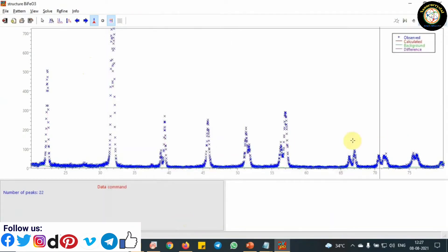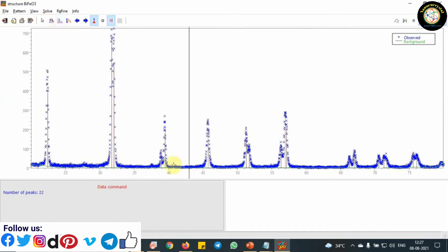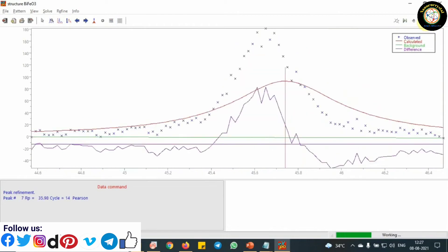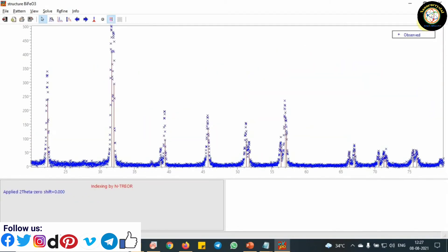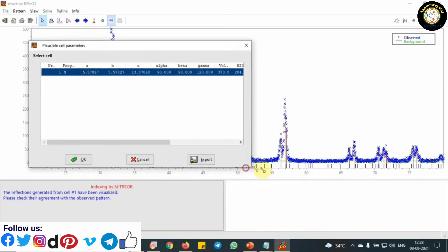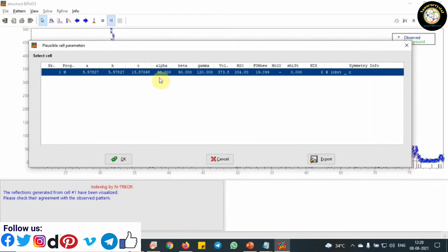Click on Next in the right side corner. Next. Click on OK.